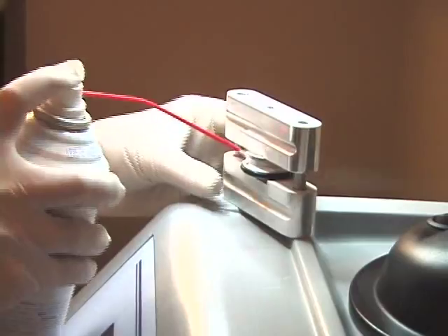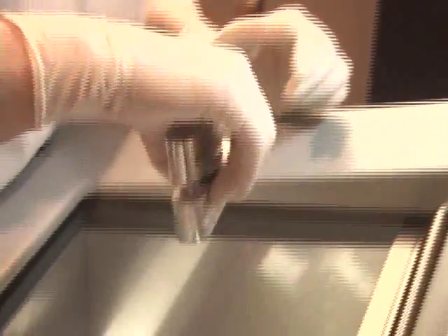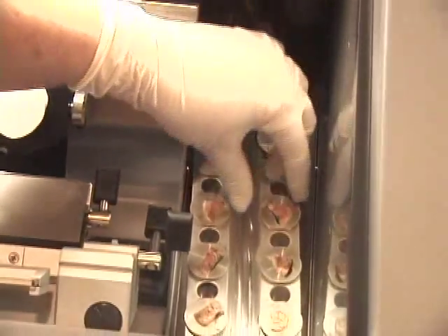The cryoembedder system is easy, fast, efficient, and accurate — cost effective, durable, and has been proven in labs and offices across this country and around the world to be a valuable instrument in the processing of tissue for frozen sections. Simply said, it works.